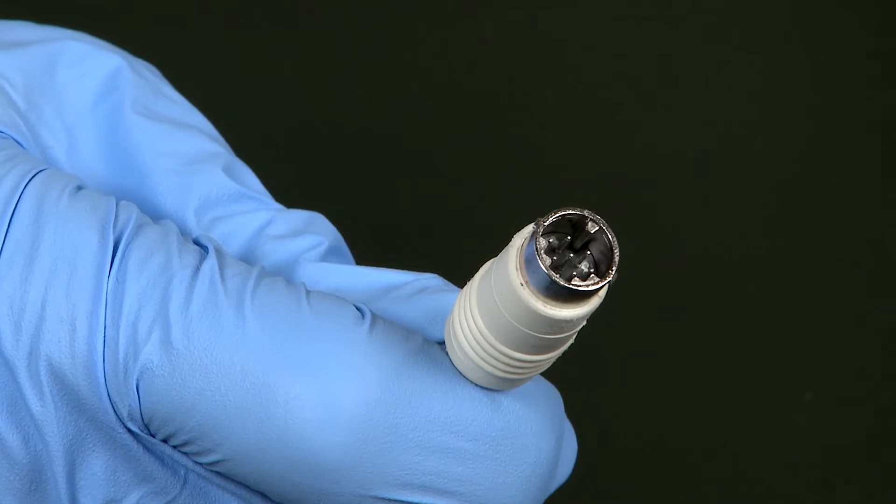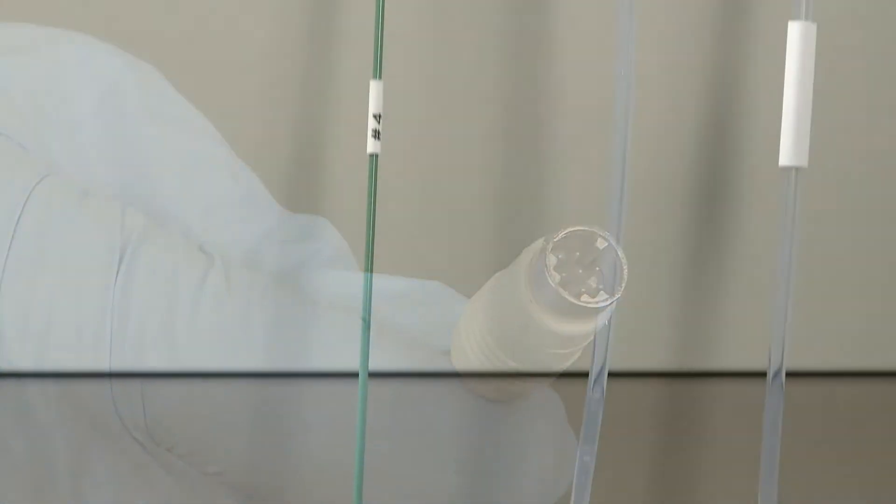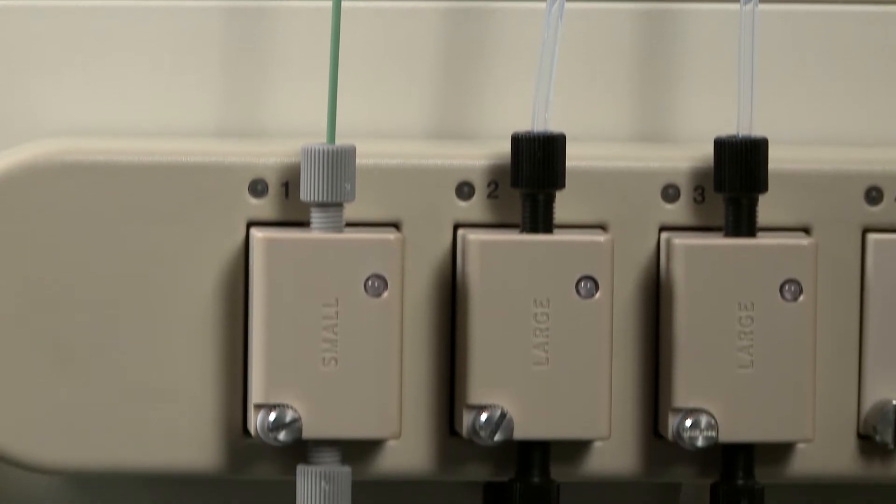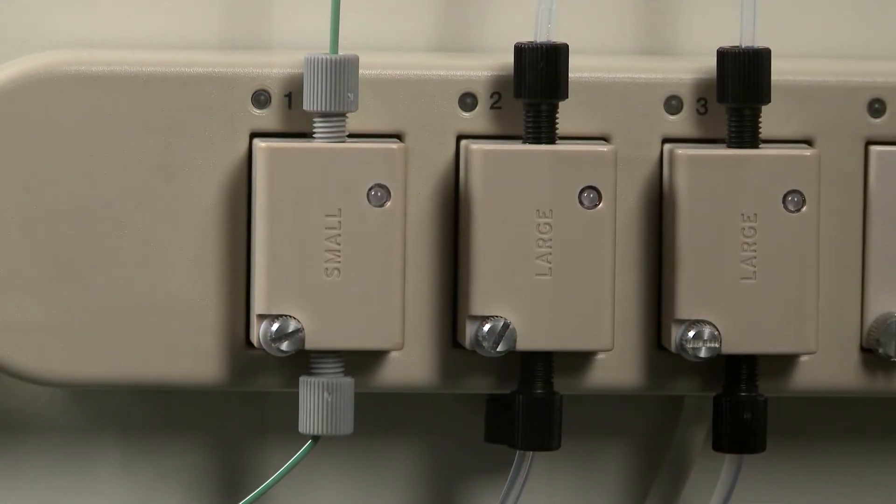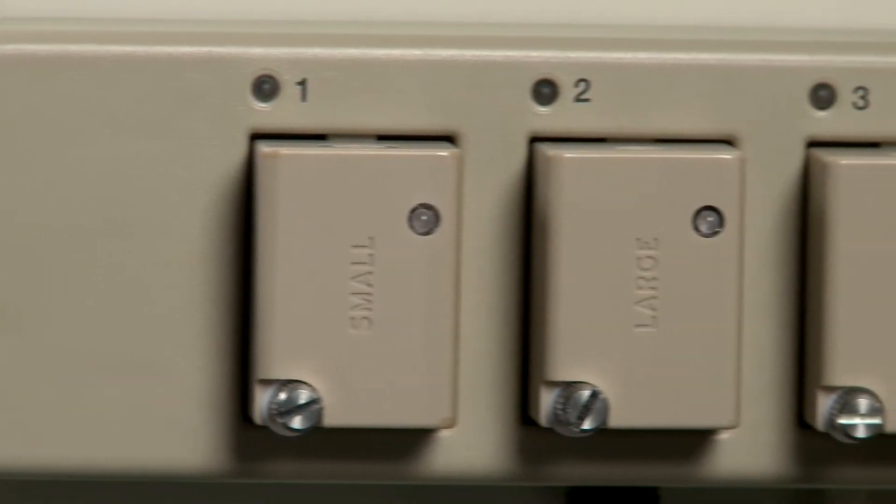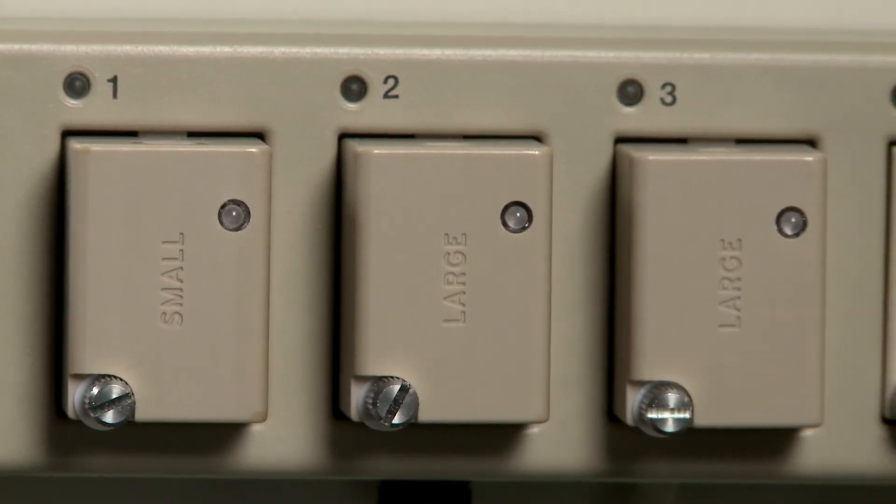Individual air sensors are available in two sizes: a large-bore sensor for use with one-eighth-inch PTFE tubing and a small-bore sensor for use with one-sixteenth-inch PEEK tubing.